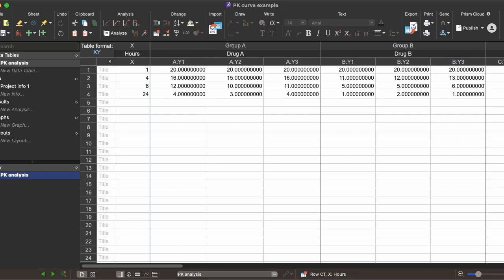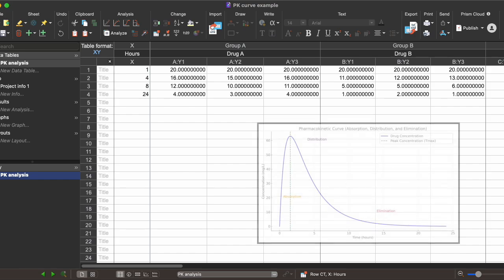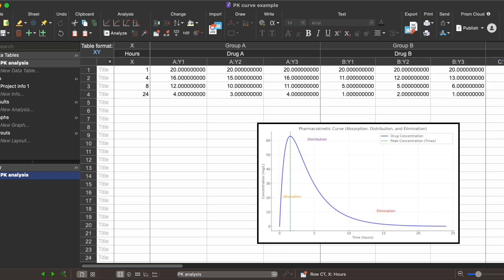In my example I'm showing drugs that were administered intravenously, meaning they go straight into the bloodstream. So we're skipping the absorption phase that would come with a drug administered orally, for example, and going straight to the distribution and elimination phases.